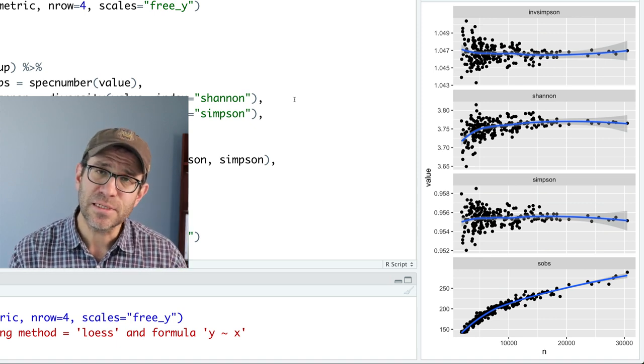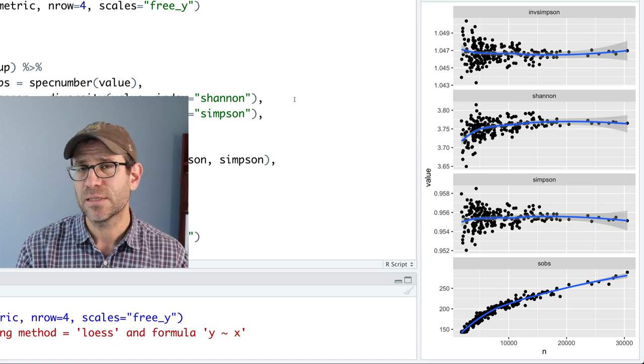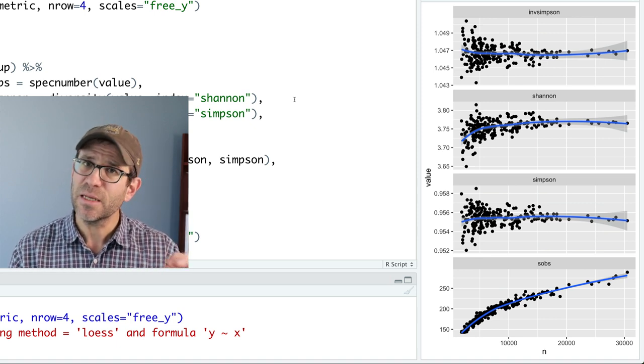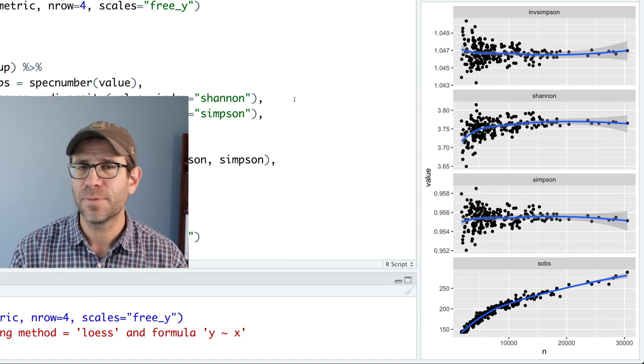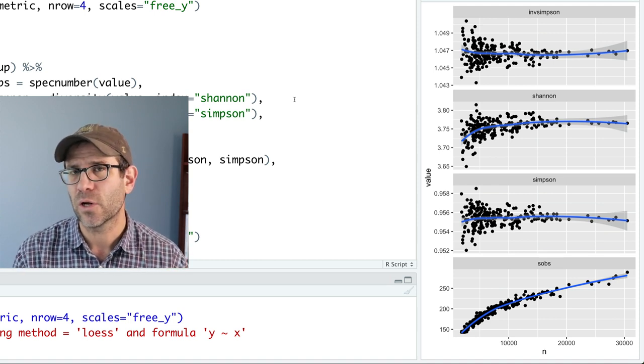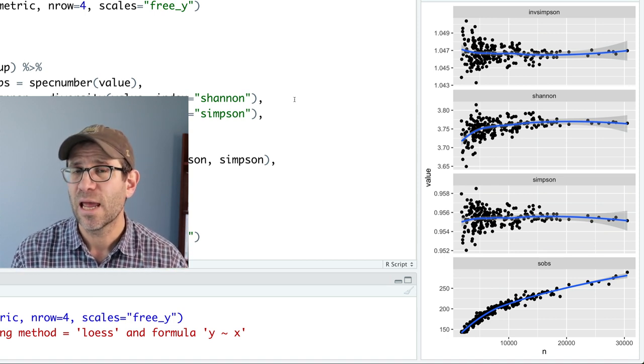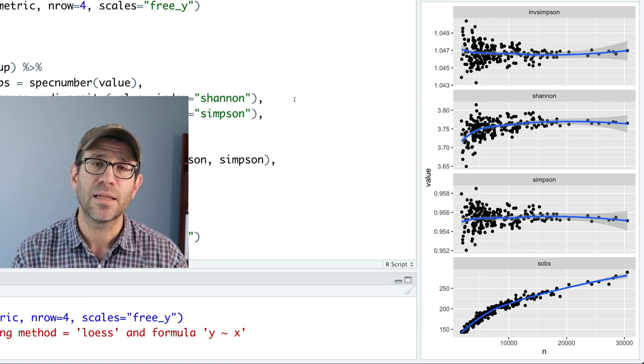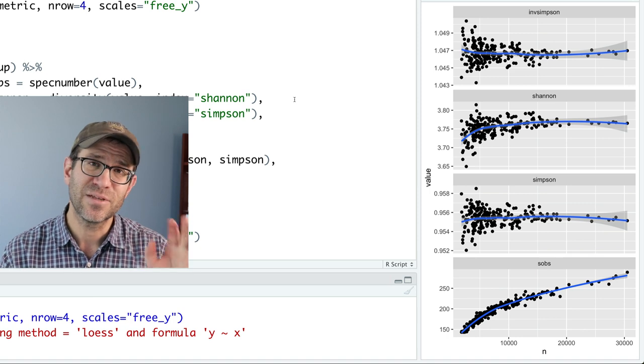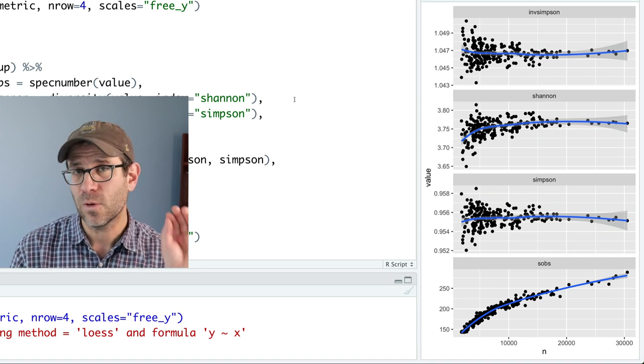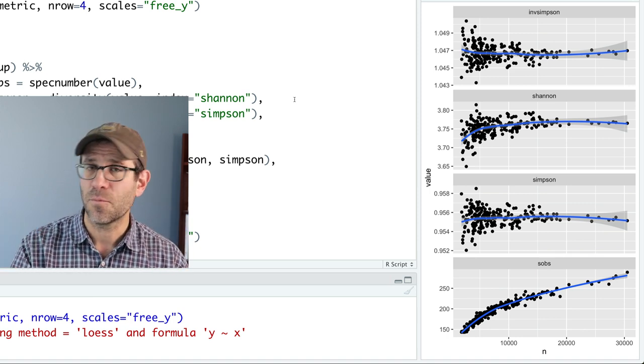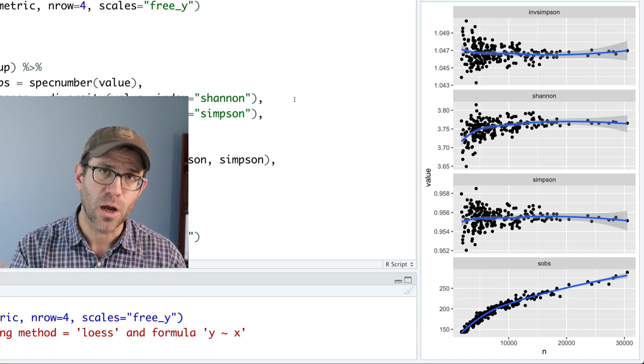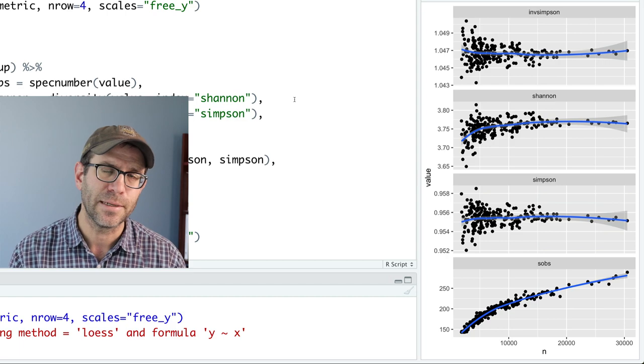And then the Simpson and inverse Simpson have a little bit of a sampling effect but not nearly as great as the Shannon. And that's most likely because of this difference between the relative abundance squared versus the relative abundance times the log of the relative abundance. I hope that all makes sense.